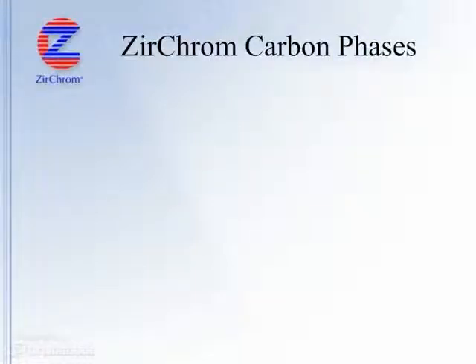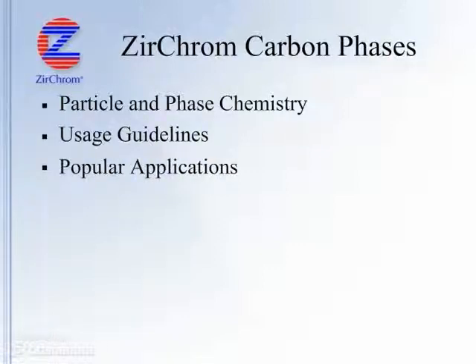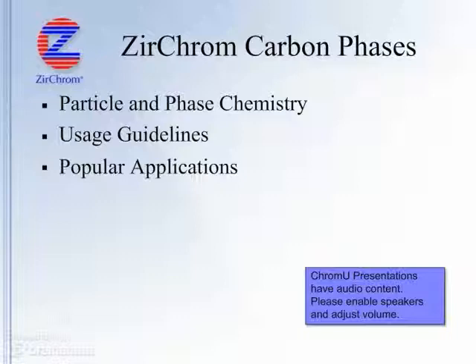The carbon phases webinar will begin with a brief overview of the chemistry of the phase and the underlying zirconia particle. It will continue with some guidelines for use. The webinar will conclude by highlighting 3 of the most popular ZirChrom carb and diamond bond C18 applications.